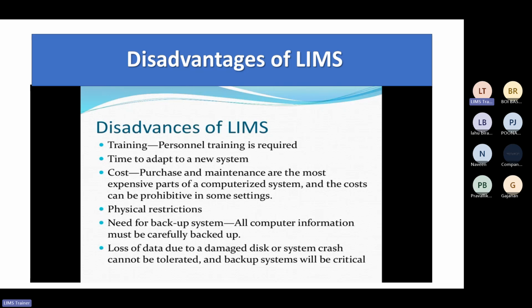Implementation is taken as a project. Then the physical restrictions are there. Why physical restrictions? Because suppose a printer is not working, or it is not showing integration with the particular software. Now you cannot do anything, right? You have to call the IT person. When the IT person solves the issue, then only you can work with the particular software and go ahead with your work. There are some physical restrictions. You cannot do anything if the system is not working.